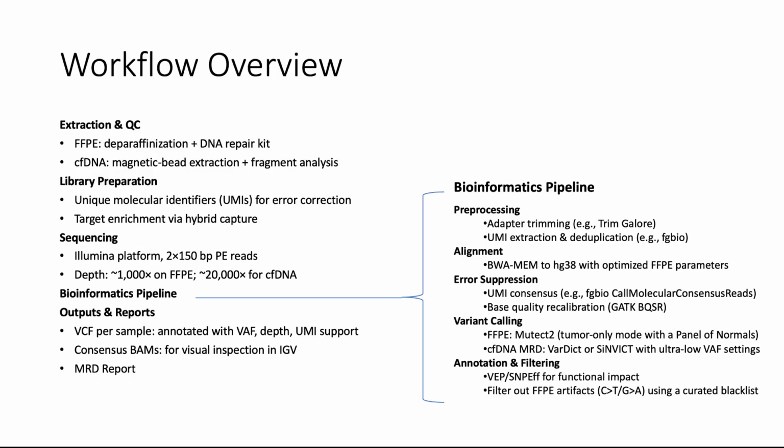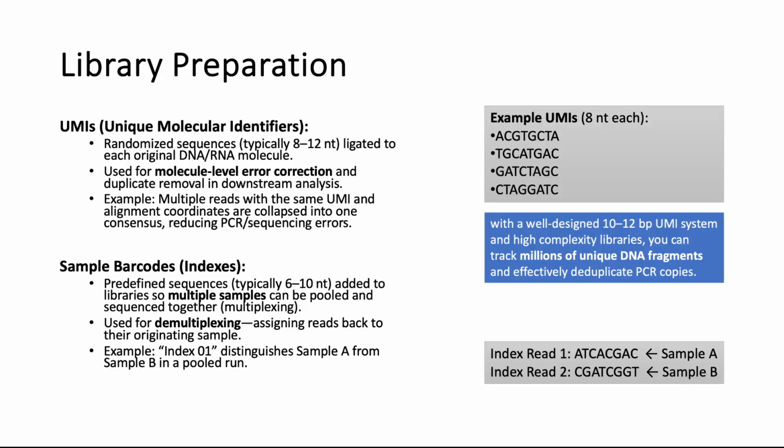There are different tools for this stage, and after we have our VCF files, we can use annotation and filtering to focus on the most interesting areas of the genome, which we are going to work with. And after that, we're able to process this data to produce our output results for each sample, providing annotated data about these reads.